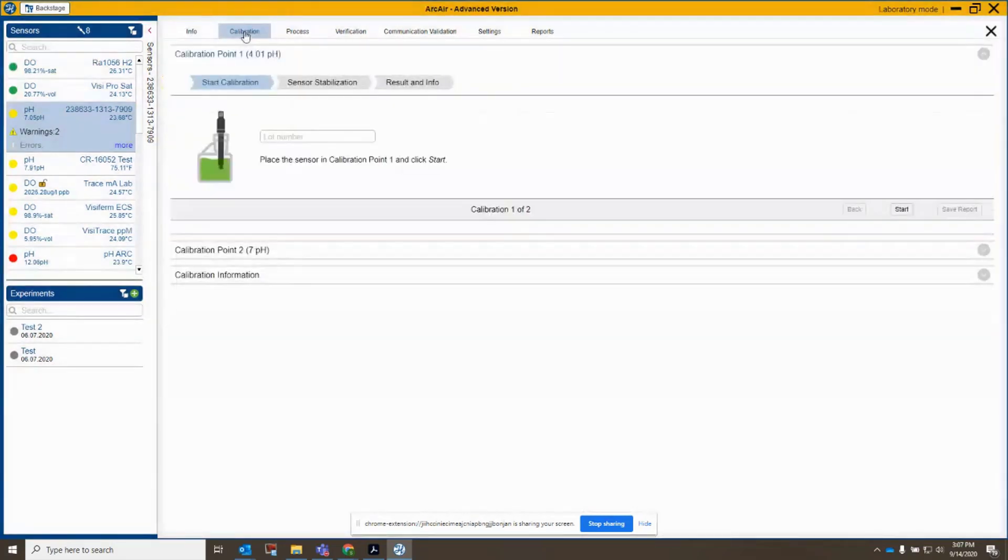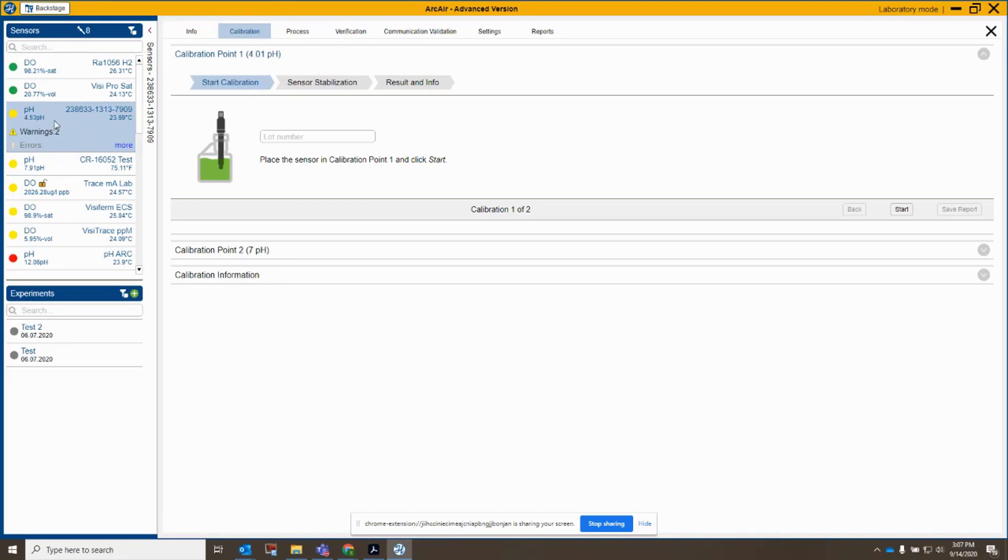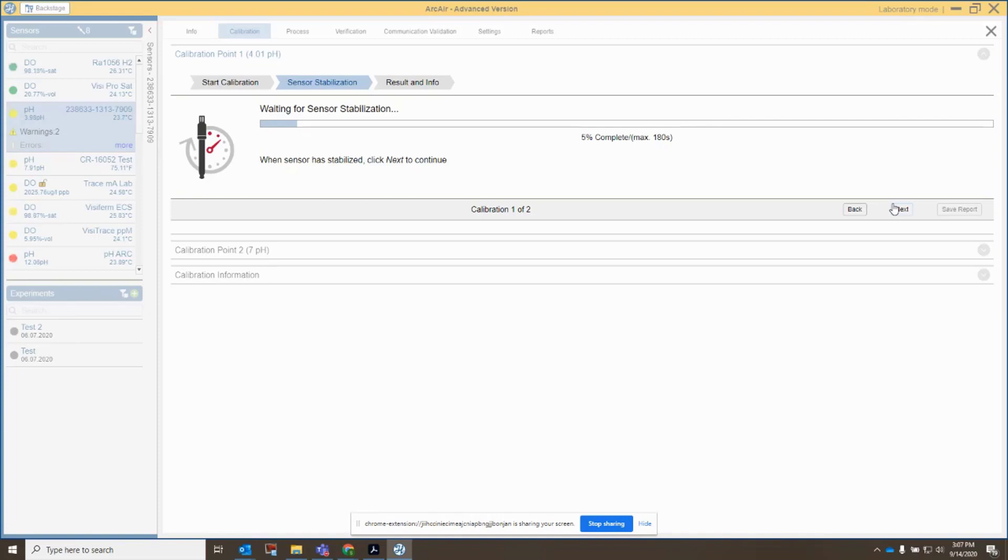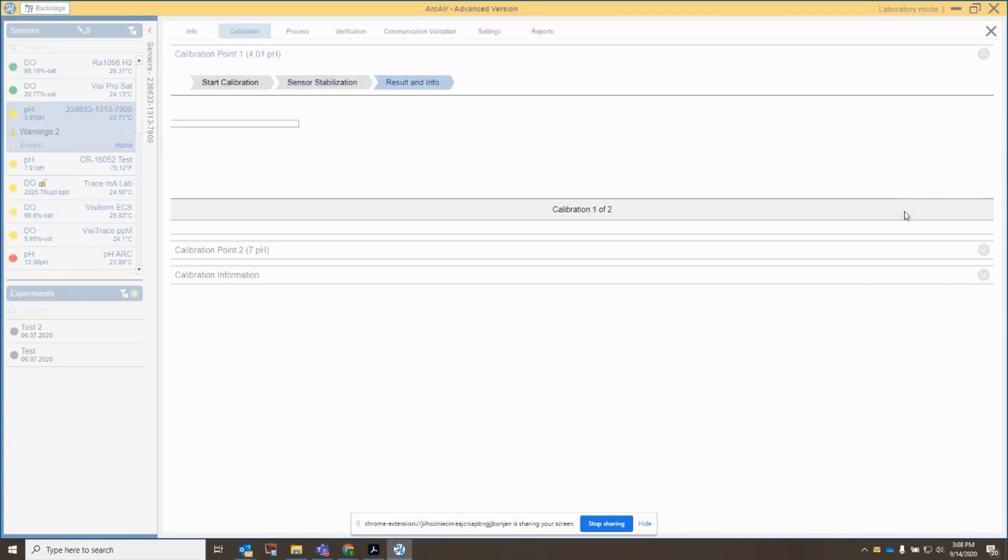So I'm going to go over to calibration, and right now I'm going to move the sensor over to my 4 buffer. So we'll start off in 4 buffer here. The value is starting to decline here. I'm going to put in a lot number, and I'm going to hit start, and let's give the sensor a little bit of time here to fully acclimate to the 4 buffer that I just moved it into. I can see right now it's at 3.98, so it's doing very, very well. It's responding very quickly.